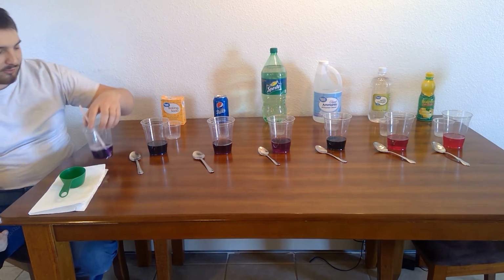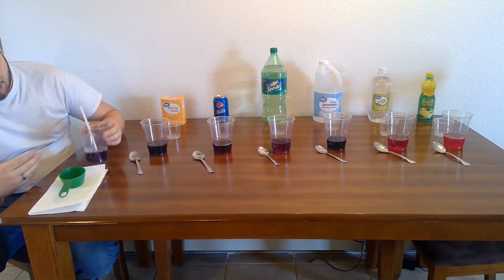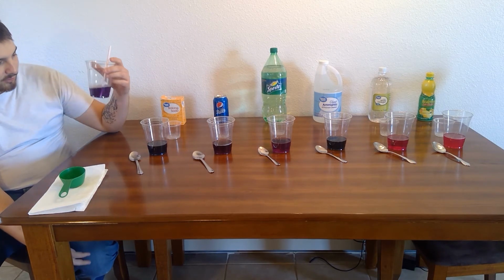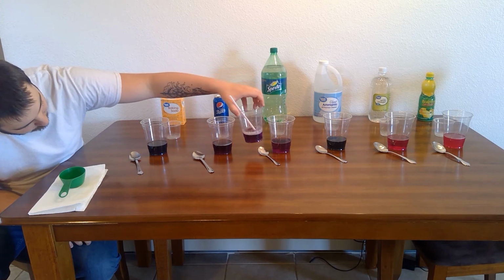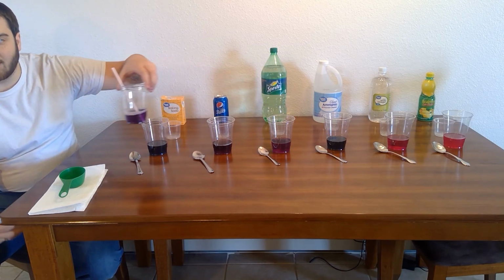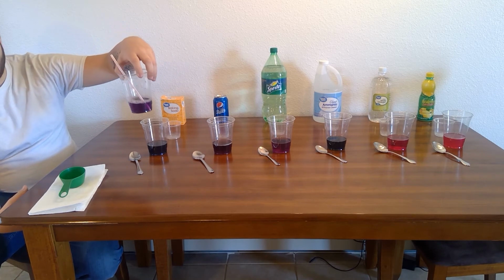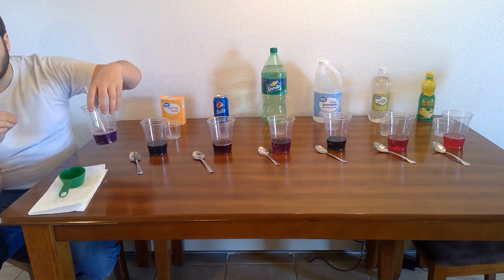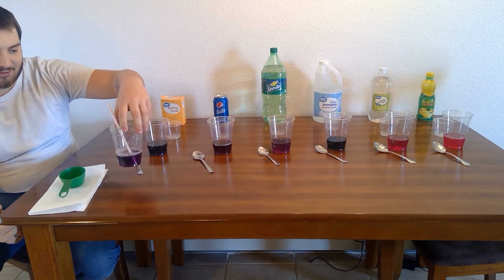So what this showed was me blowing CO2 into the pH indicator that we created with the red cabbage, and it almost would fit right in between the Pepsi and the Sprite with how much I was able to put in within that minute. That was kind of interesting watching it. As I was blowing into it, you would see a burst, and all of a sudden you'd see a little bit of purple come in. It was really cool watching it mix.